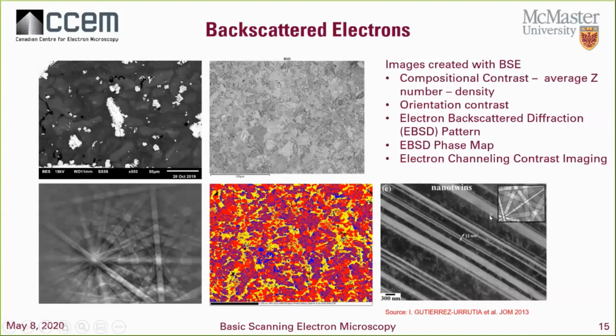Over here we have a technique which is not necessarily available to everyone, where we can do electron channeling contrast imaging. And we can actually look at the dislocations and image them within a material.